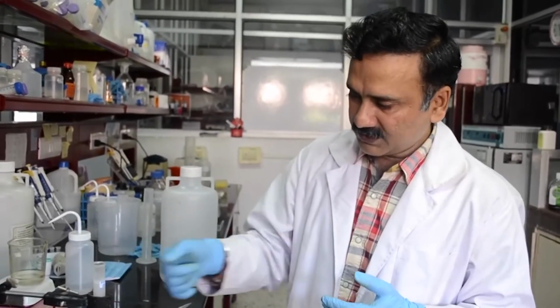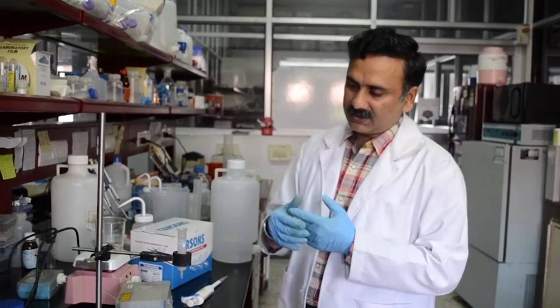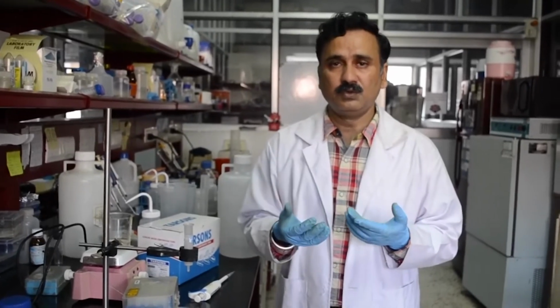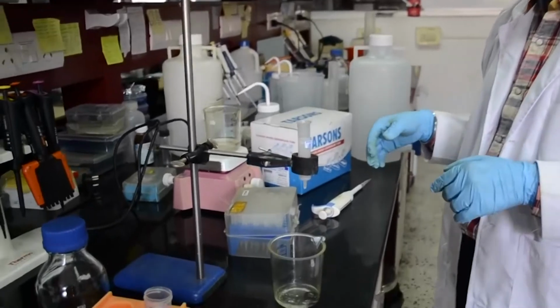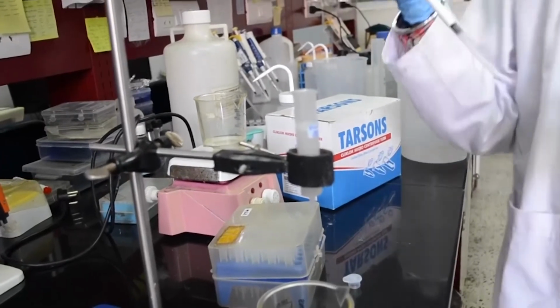So let's first do the equilibration, and then we are going to load the sample, and then we are going to tell you the further downstream procedures. Now we have equilibrated the column with 4 to 5 column volumes of the water or the buffer in which you want to do the buffer exchange of your protein. What you see is the level is going to the disk, and in between you have to prepare the sample.